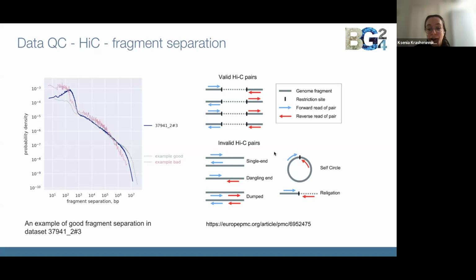The dark blue line shows the insert size density measured relative to the mapping of the contigs. We are particularly interested in the shape in the long range distance, because we use the Hi-C data to join separated fragments. So ideally, this should be a curved shape.